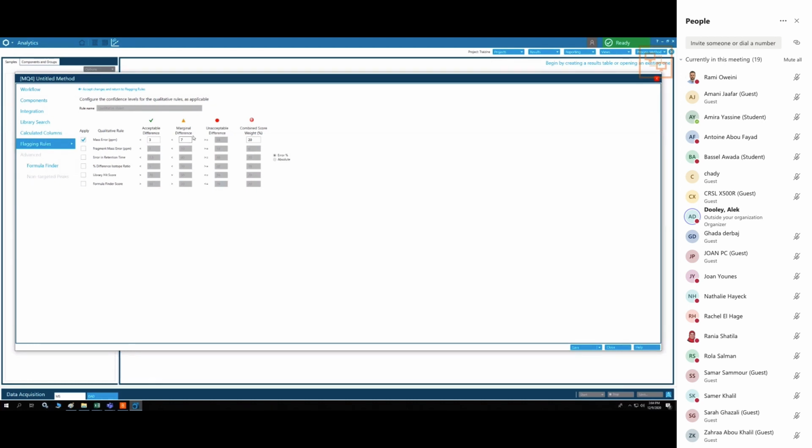So the idea is to make it easy for you to see what you want. If you want to see things that are better than 5 ppm, you can also come here and change that. Today we'll just use my preferred numbers, but keep in mind you can come here and change these numbers. There's not really any rules related to that. Okay, so fragments, we don't have fragments today. We don't have any known fragments, so we won't turn that one on.